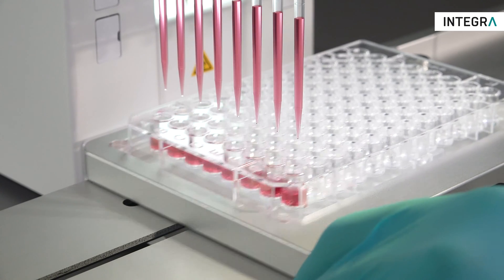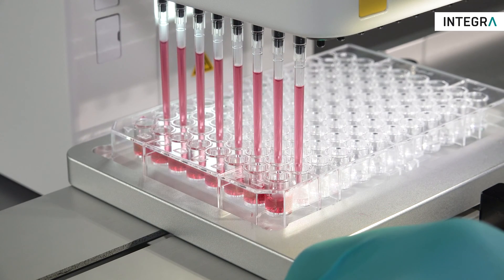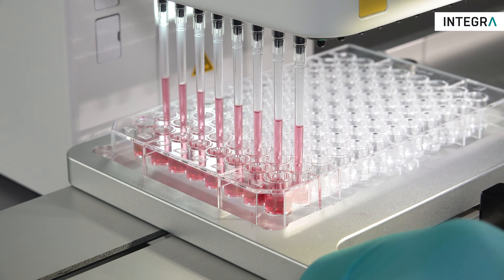In addition, the ability to partially load tips — for example, only 8 channels at a time — means that the MINI 96 can completely replace the need for 8 channel pipettes in the lab as well.